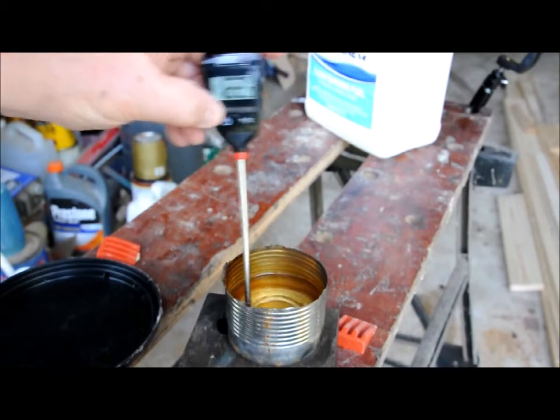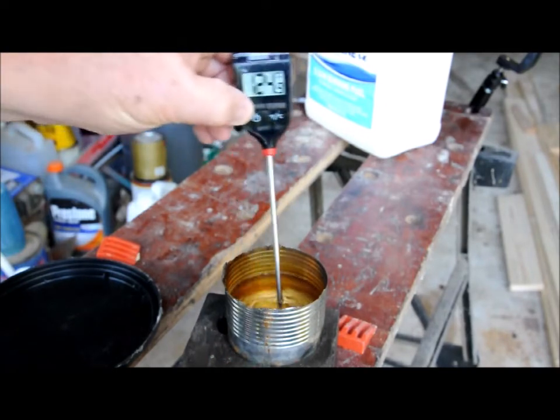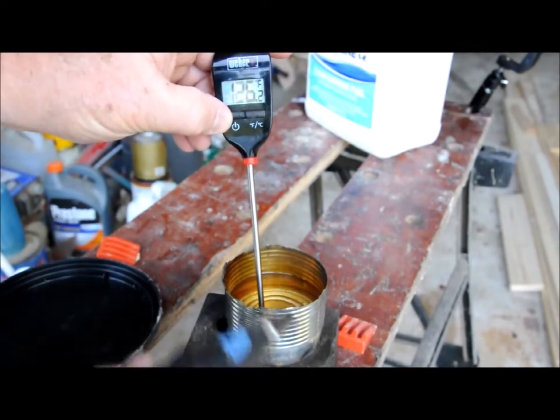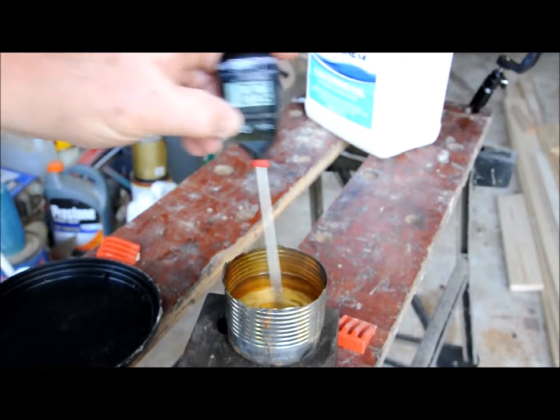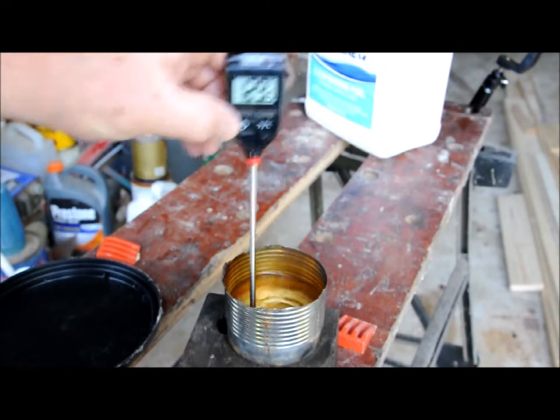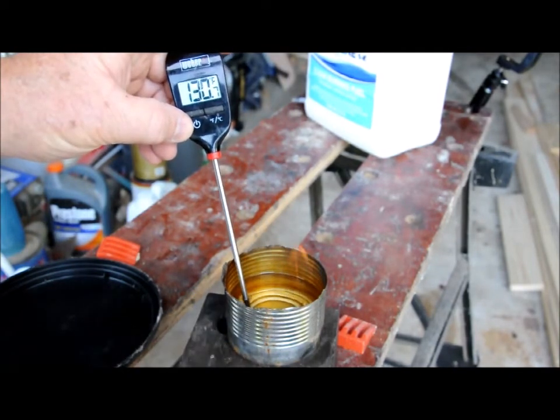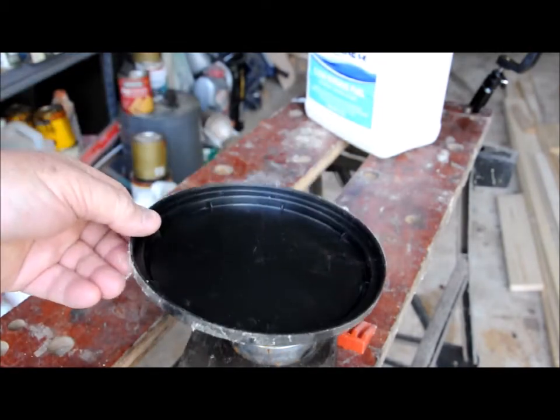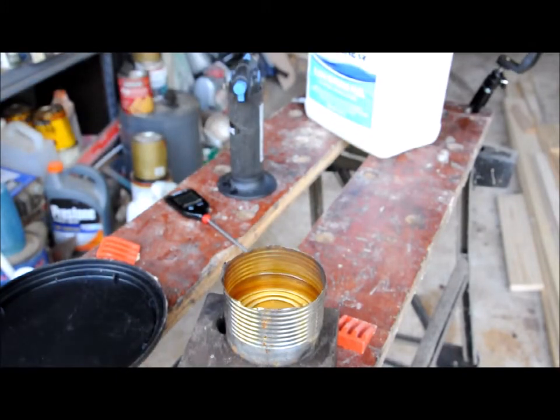120 degrees — still just a little bit of a flash. 122. 124. 125. Slight flash but it's not a maintaining flame. 127. 128. 129. Okay, there's 130. And now we have a fire. So 130 degrees is the flash point on this kerosene.